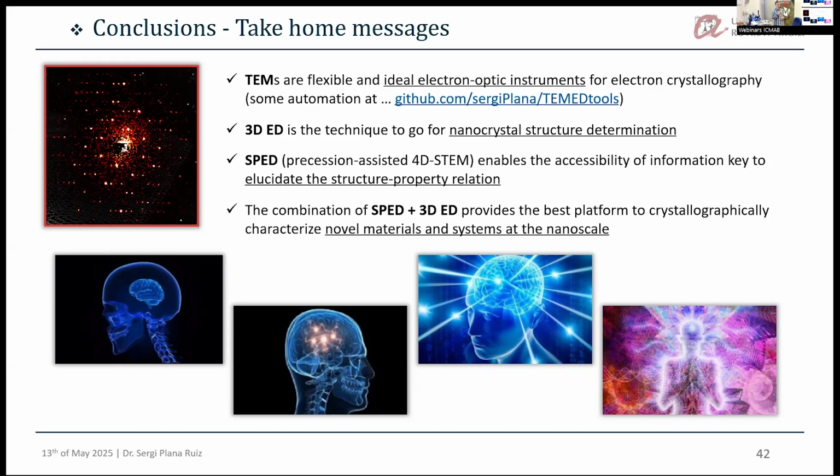I don't know if in that case it considers the relativistic effects of electrons, but you can see as well that even if the transmitted beam, the disk itself, is not moving, the distribution of intensity inside the disk is moving, and this can be simulated. So I'm not so sure if that framework considers it.